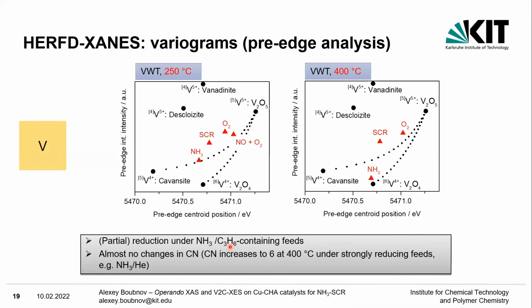It's a very nice way of describing that, but obviously, with XANES in particular, it would be very nice to be able to hone in further as to what the geometry is, or what the true oxidation state is if it's some sort of mixed species. Or have you had to rely on Raman and other spectroscopic techniques to get those answers?